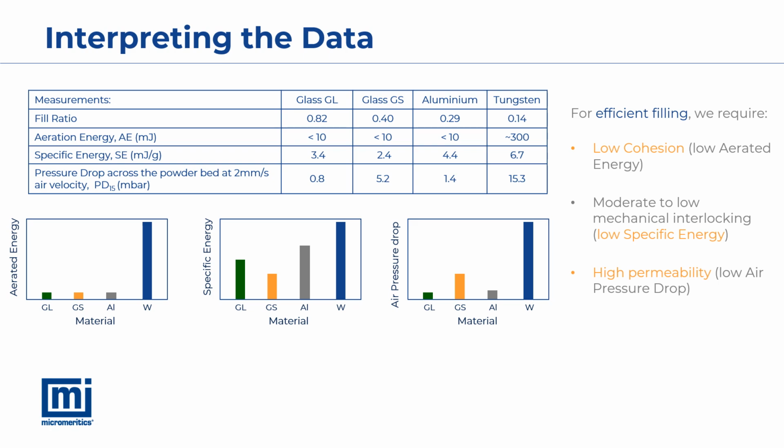In that case, we need to apply some criteria if we are to use these test procedures as a predictive model. Remember that we don't want to make tablets out of glass beads or metal powders. We just want a test which will allow us to predict whether a given powder that we're making tablets from will behave favourably in our process.